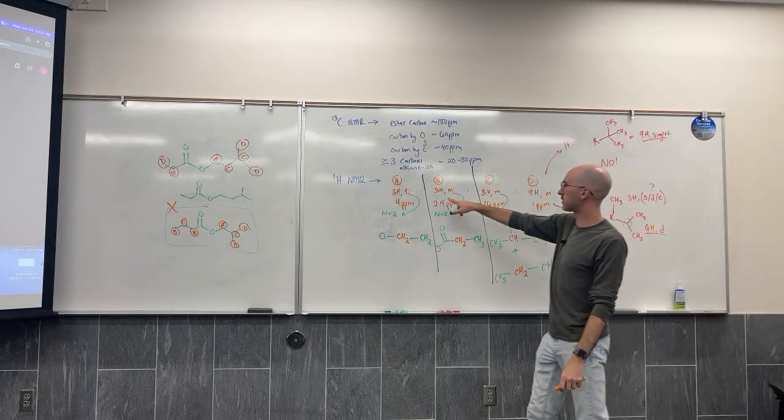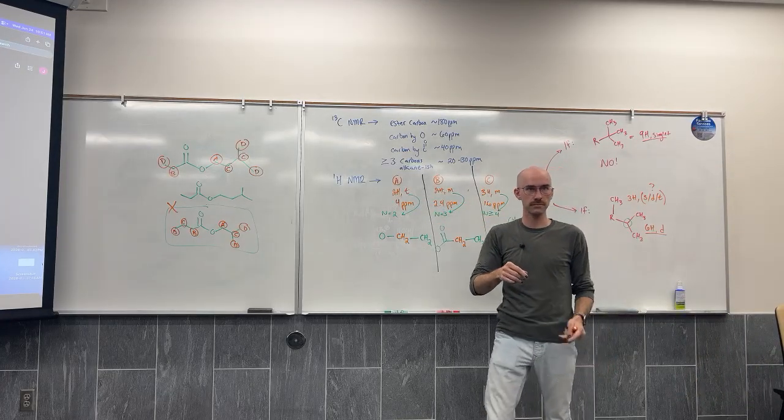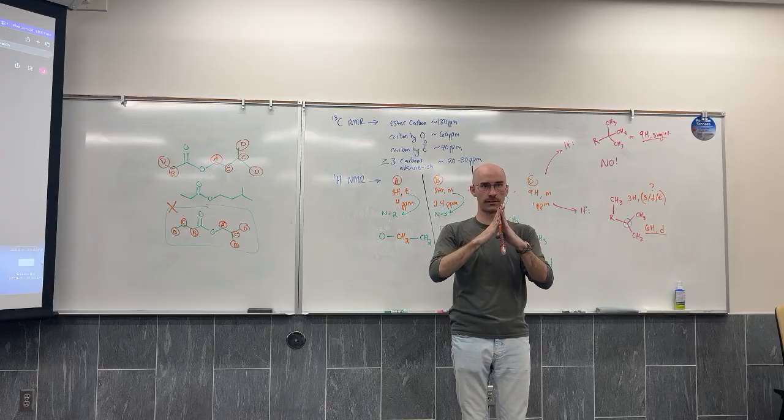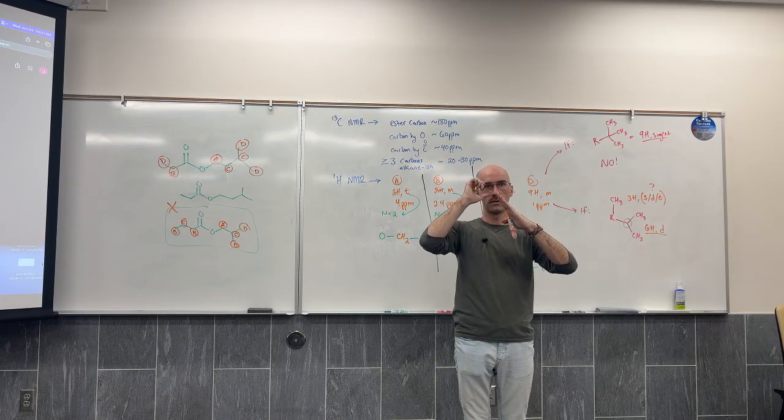Integration is where we get these numbers. Integration is a calculus term. It means everything included under the curve, the area under the curve. Was that just based on eyeballing it? Is that how we decided that? You didn't decide it at all.